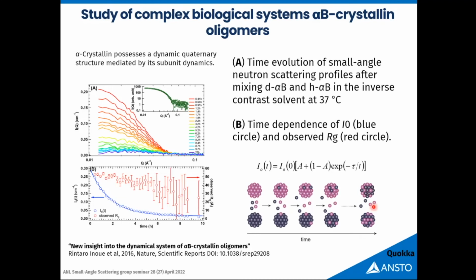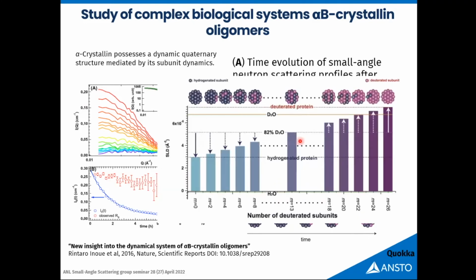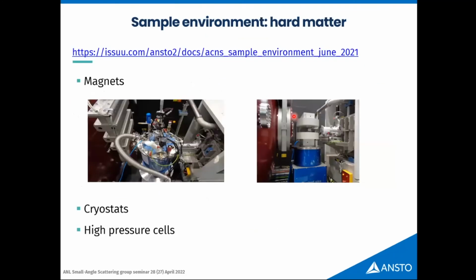But in terms of SANS, it would mean that at first we've got a lot of contrast scattering, but with time, it will disappear. And this is exactly what happened. Once you go to the middle, they've got perfect disappearance of scattering, confirming the idea that units are really interchanged. So it's really fun. You have the same material, but colored differently, and you can watch what's going on there.